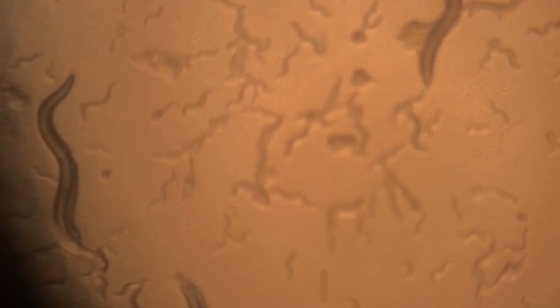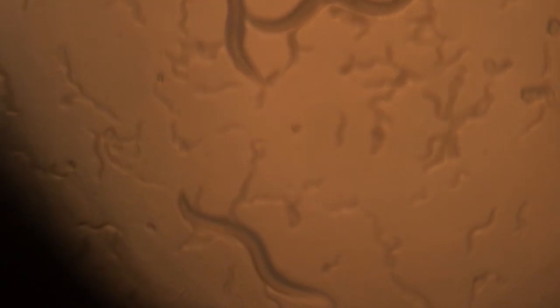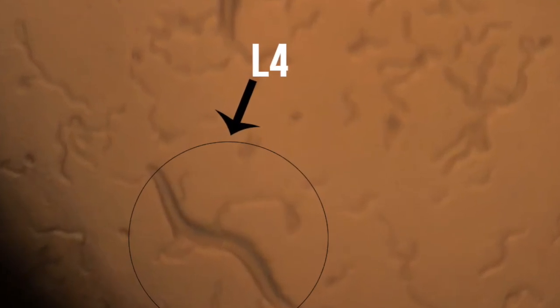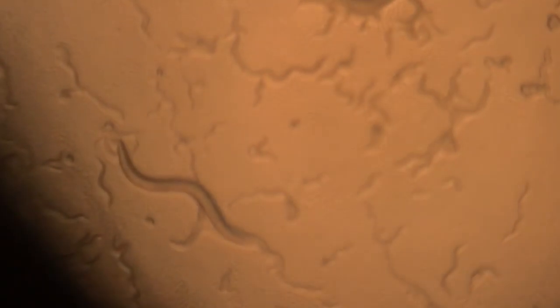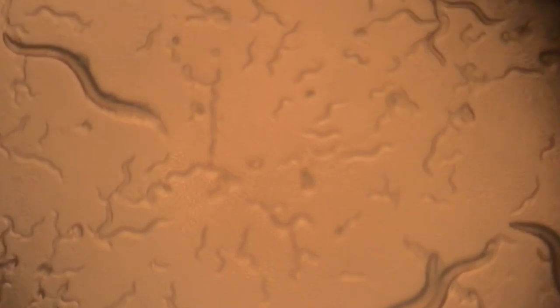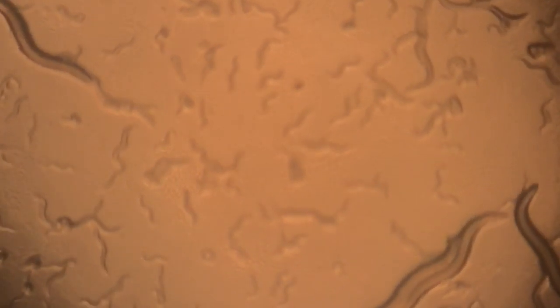First, we bleached the worms with a drop of bleach to kill the adult worms. Then, we added a drop of the M9 solution to pipette the worms out of the original petri plate. We swirled the M9 buffer around to attach to the worms and then pipetted 1,000 microliters of the solution with the worms to the other petri plates containing the certain bacteria strains with double-stranded RNA.